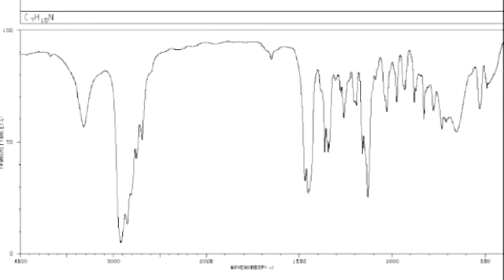Okay, so here's our first molecule. Looking at the top left, we can tell that this must be some sort of totally saturated amine. Moreover, look at about 3300 there. We see a smooth, medium peak. Because there's just one of them, we know this molecule contains only one N to H bond. That means it is a secondary amine with two C to N bonds and one N to H bond.